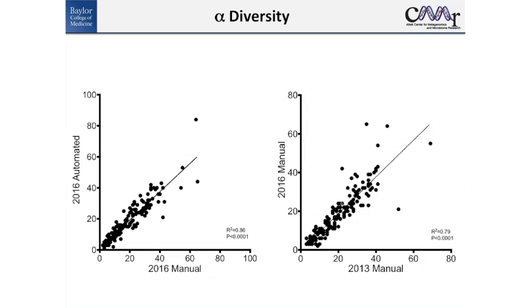Yeah, it does. I have another very interesting question. Was there a particular reason why you chose the MiSeq DX instead of RUO MiSeq? Good question. So the reason that we chose the DX, again, being in a CAP-regulated environment, is I needed the performance qualification, which is a very time-intensive document to generate for yourself, and so that came with the DX model, so that's why we chose it. But obviously you can run these studies on a regular MiSeq as well. In fact, we run it in RUO mode. We don't run it in the DX mode. The decision was purely around that document.